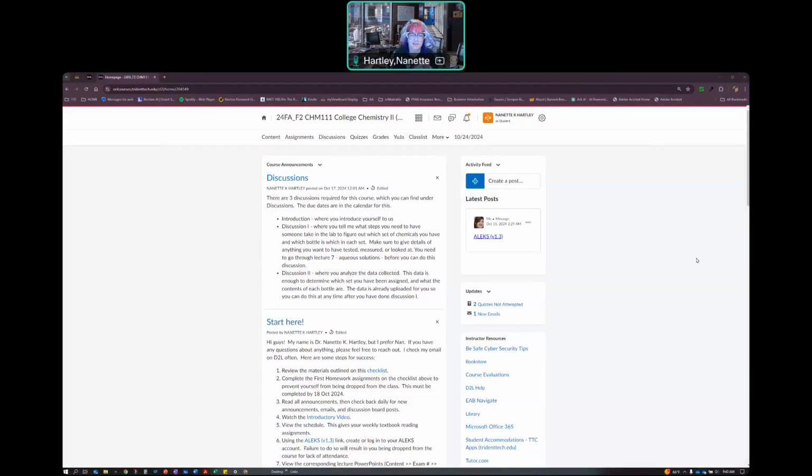So we're getting ready to talk about our first experiment that is not a virtual experiment. This is experiment 4. This is going to be a little bit different than what we talked about before. Hopefully you'll be able to follow along. Experiment 4 is related to the solubility product constant, so we're going to walk through a little bit of the information that goes with this.